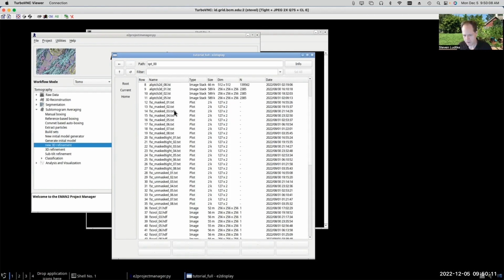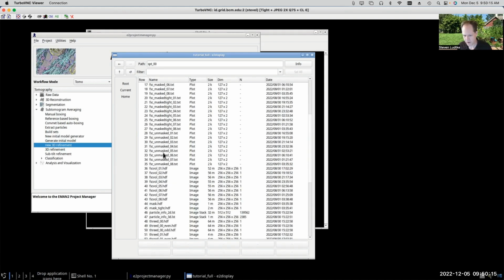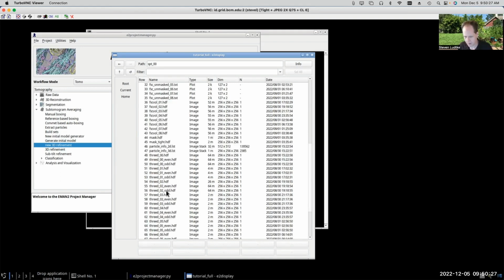If you tell it to do the local top hat filter, then you'll also get these FSC vol files. These contain the per voxel FSC values. Basically contains a local resolution plot. Often these will be downsampled, although in this case it's actually, no, that's not true anymore. The new routine for doing the top hat equals local actually generates them in full sample.